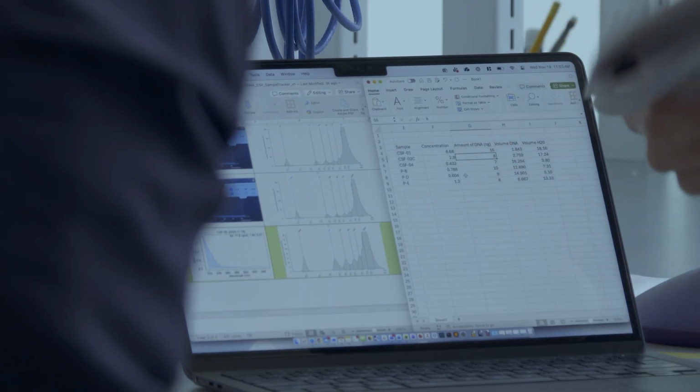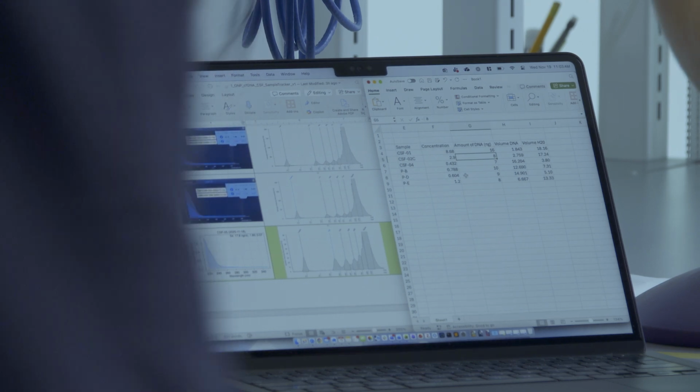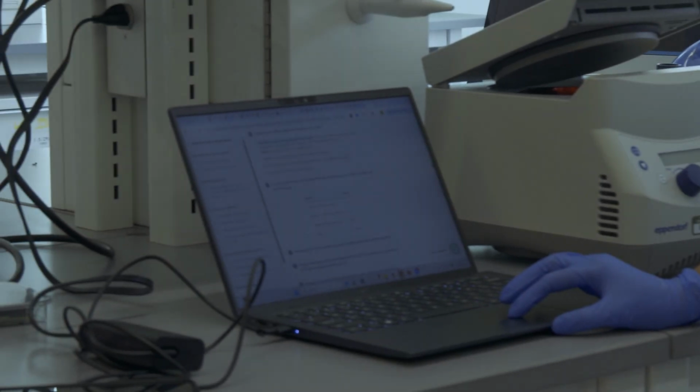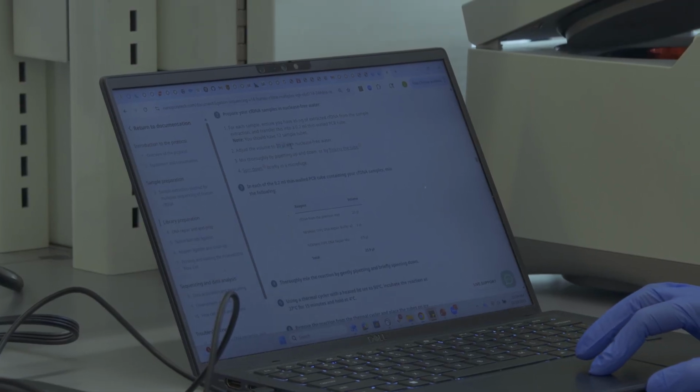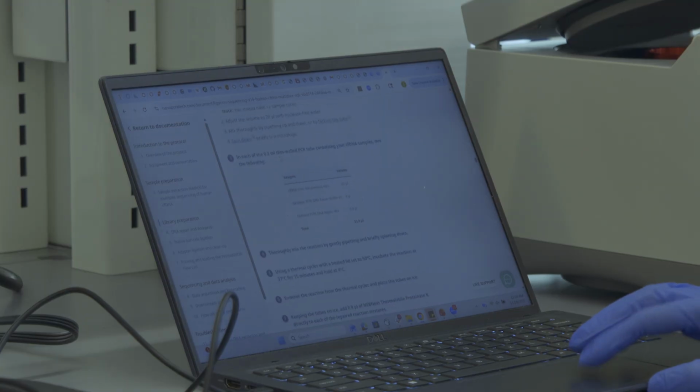Let's do that. So the first step, once again, let me show you here. For each sample, we are taking at least 6 nanograms of extracted cfDNA, and the volume would be 20 microliters. That's the max volume. The reaction is DNA repair, right?